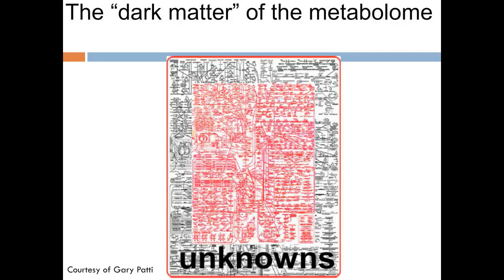So with untargeted, if you put these two together, we can improve our potential ability to distinguish this kind of health paradigm. And this really means there's expression beyond what we normally run that allows us to see more information. And this is one of the reasons doing an untargeted approach may enable new clinical diagnostic paradigms.